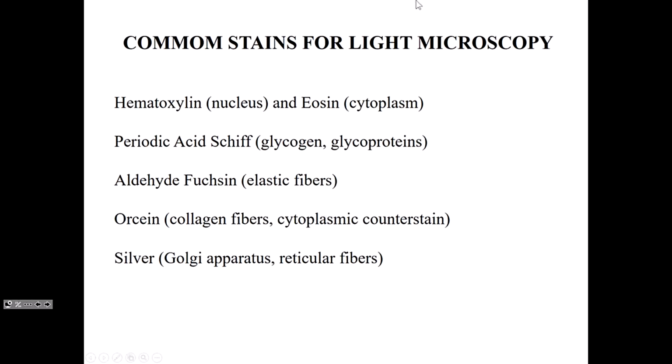And the hematoxylin, which is like a purple stain, will stain the nucleus and nucleic acids, ribosomes, things like that. The eosin is a counterstain for pretty much everything that's cytoplasmic. So you get a purple and a kind of pinky orange eosin color counterstain. And that lets you see pretty clearly many of the structures within a cell at the light microscopic level.